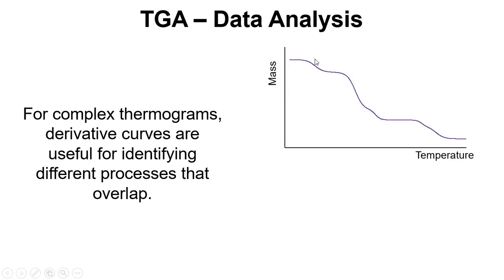if we take the derivative, we can see and pull out different features. For example, this step here, we can clearly see that it's happening in two steps and that wasn't particularly clear here.